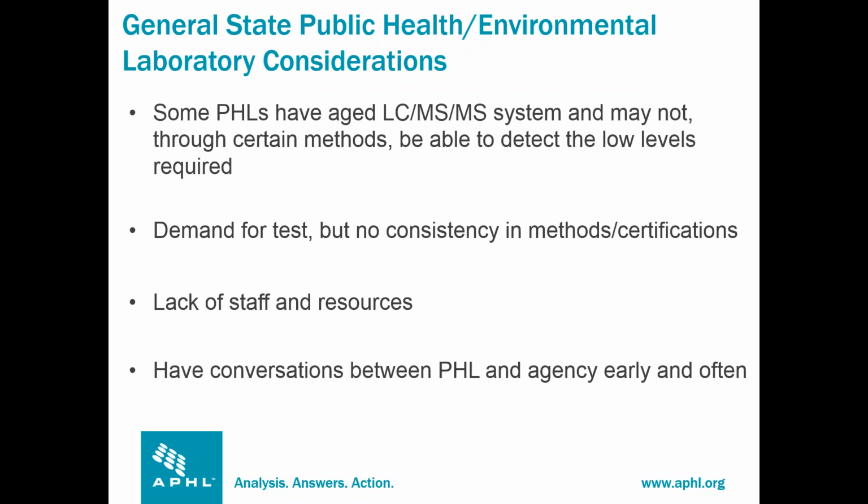And then if you are going to work with the public health laboratory, make sure you have conversations between everybody involved early and often. This can help to determine data quality objectives based upon the proposed data usage and the required reporting levels, and that can all highly influence turnaround times and the practicality of getting what everybody needs.